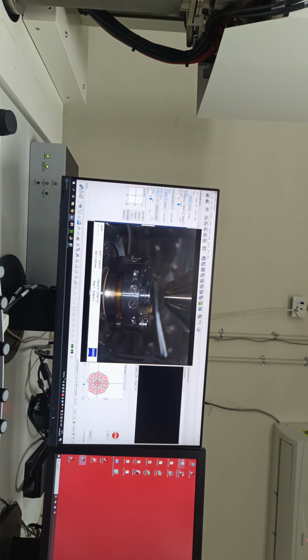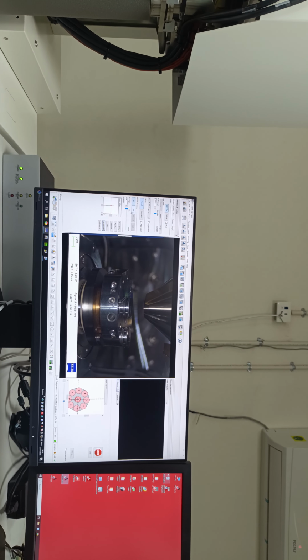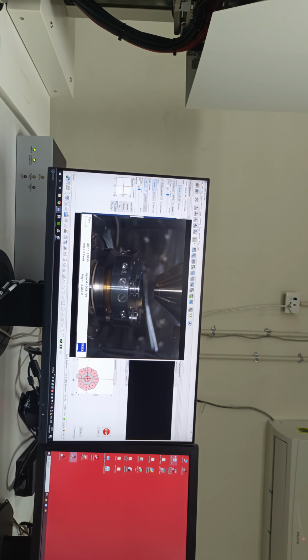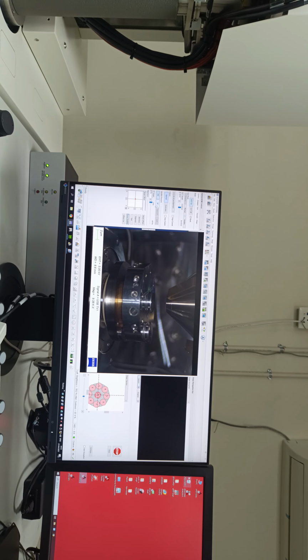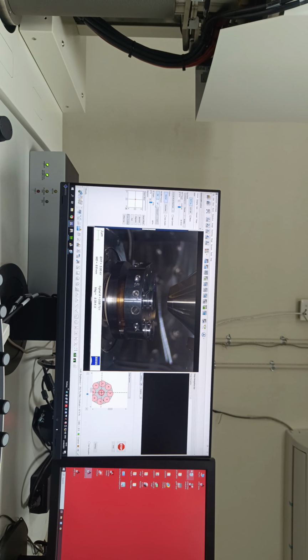So these are the 2 modes available, HV and VP. As you can see, VP stands for variable pressure. So biology people, you can use the VP mode here. I mean, you can come here and ask, since your sample, when do you use the VP? Anyone? Not you. Does anyone use the VP?